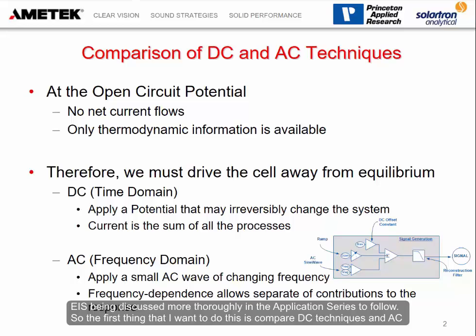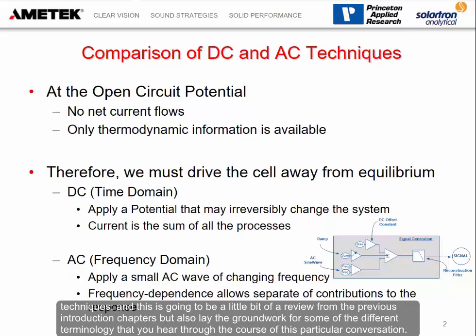So the first thing I want to do is compare DC techniques and AC techniques, and this is going to be a little bit of a review from the previous introduction chapters, but also lay the groundwork for some of the different terminology that you'll hear through the course of this particular conversation.